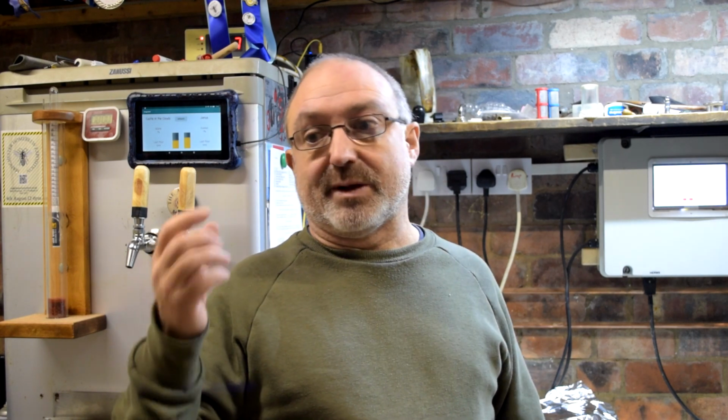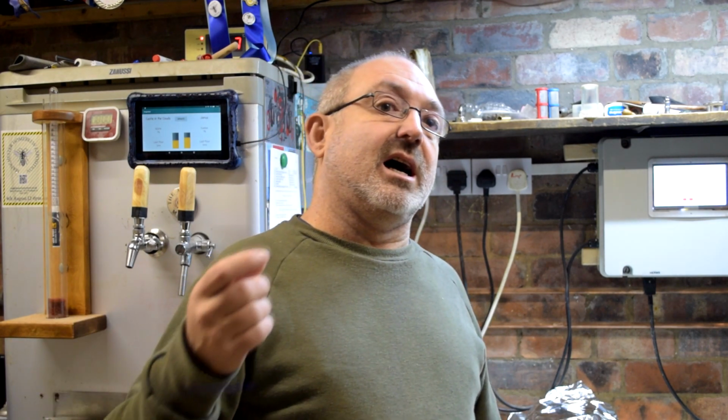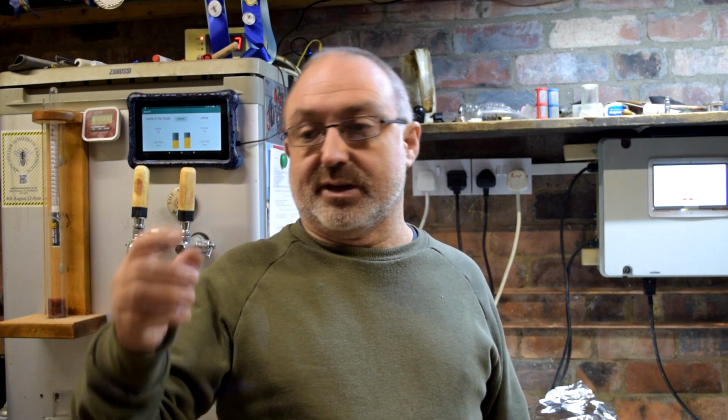So to start with, I probably need to talk a little bit about the microscope and the hemocytometer. The microscope needs to have a magnification of about 400 times. This can go way higher, but I don't really need to use it. For that, you put the hemocytometer on the microscope tray, and to start with, we'll have a quick look at what it looks like.